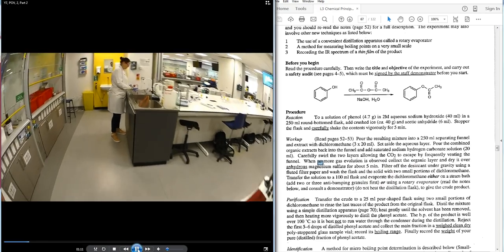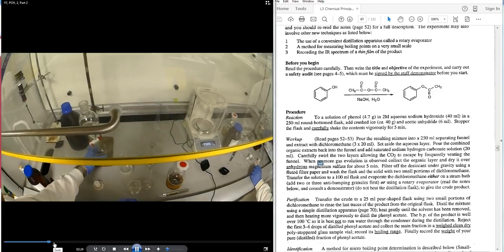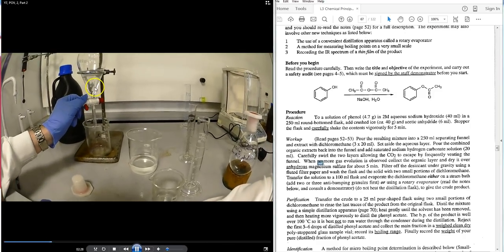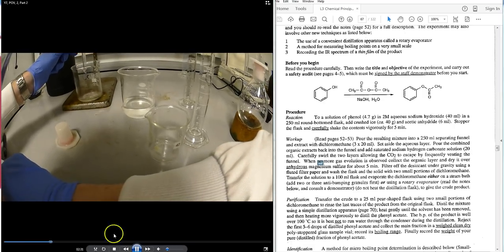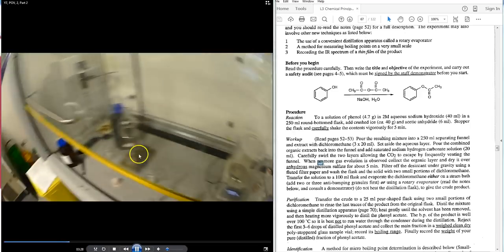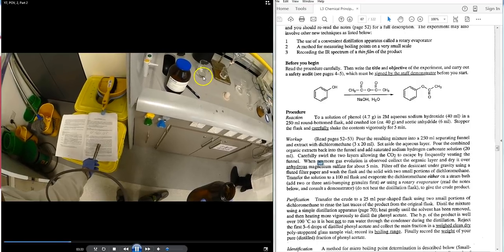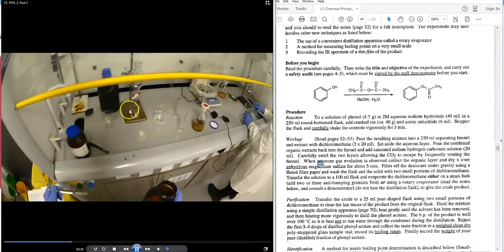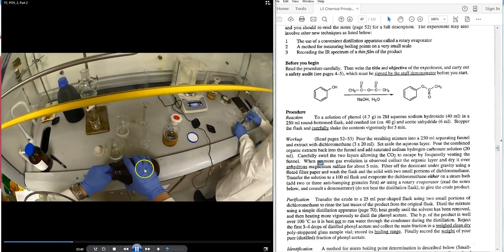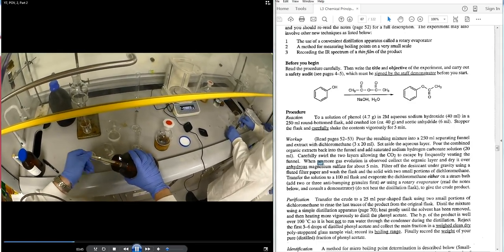The student takes the bottom DCM layer after the bicarbonate wash — note how clear it is — and runs it into a flask. Magnesium sulfate is added, one to two scoops, until it floats very gently, to dry the 60 mL of DCM containing the organic product, phenyl acetate.